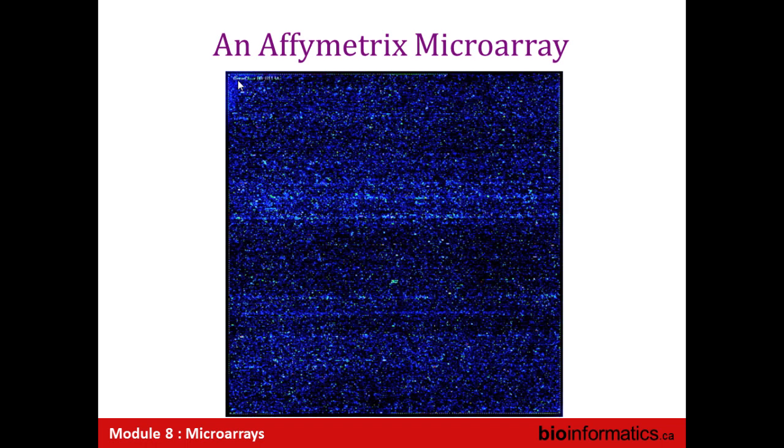Affymetrix says, we're going to make it easy in case you forgot what kind of experiment you did. The control probes on your array spell out the name of the array. So it is impossible to lose track of what kind of array you have, because as soon as you have the image, you can go to your collaborator and ask, what type of array did you do? Affymetrix. Which one? Human. They sell 40 human arrays. You know, the human one. Then you can look at the image and say, oh, you did HGU-133A+2. Great. So now you have an easy way of assessing what actually happened.